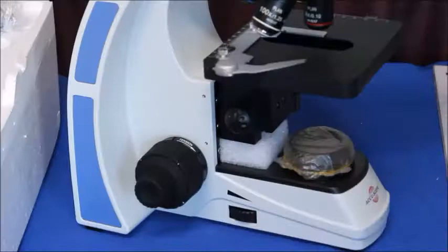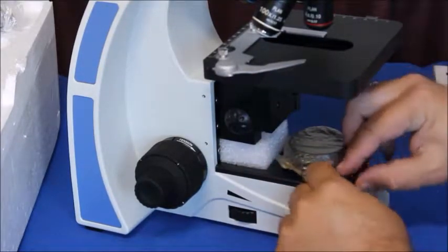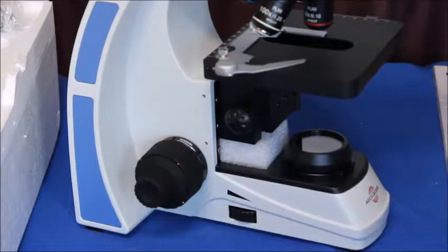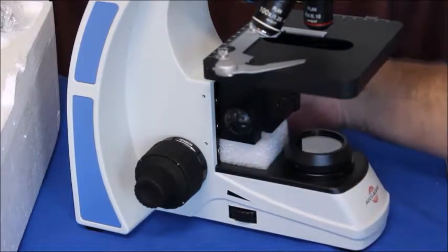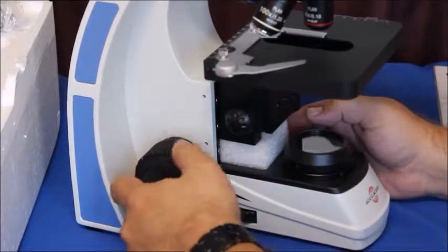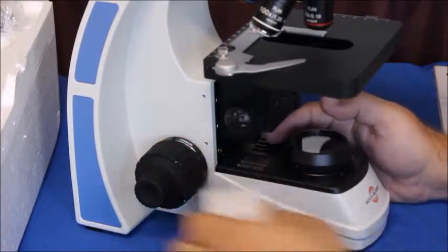Okay, now down here this is called the collector lens and it also has a rubber band so you want to try to peel it up and get the rubber band with it. And then this foam piece, sometimes people miss this and it makes it so the stage can't go down. It's a packing precaution. So you just raise the stage all the way up, pull that out.